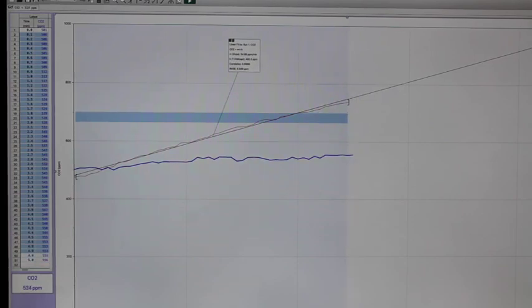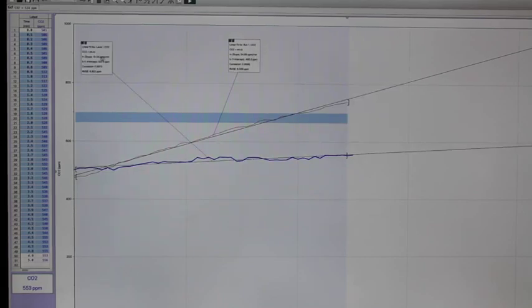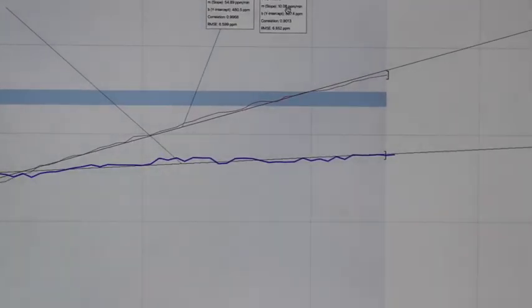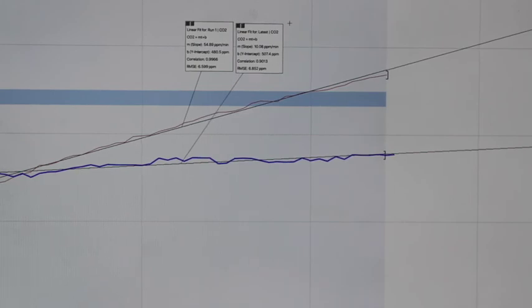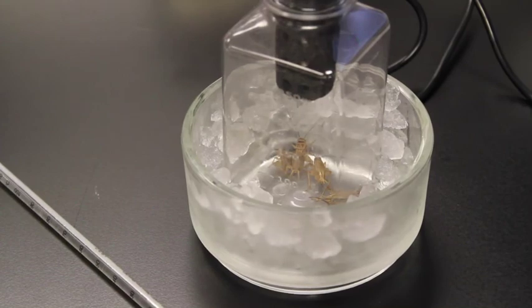So I'm going to highlight that. We'll click again on the best fit line. I really only want the latest run because I already got the best fit line for the earlier run. Grab that, and then I'll move that right next to that one. Okay. And then we'll go ahead and zoom in as far as we can. And I'll move both of these down just a teeny bit so that you can then see that slope on there. And we should also just make a quick observation of what's happening to our crickets.